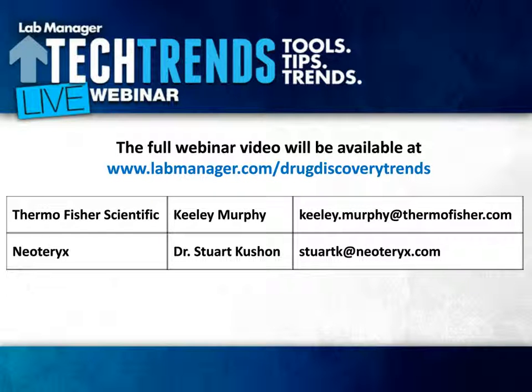Great, thank you. Stuart, could you go into a little more detail on how the Mitra microsampling is compatible with liquid handlers? Well, as you probably well know, liquid handler vendors would all prefer that pipette tips can only be used on their liquid handler. So there are always fitment issues with every liquid handler that exists. So we are currently working in collaboration with a number of liquid handler vendors in order to make the Mitra microsampler compatible with liquid handlers that are on the market. Essentially, if you saw the design, it looks very similar to a pipette tip, and that's intentional so that it can just simply fit onto a liquid handler.